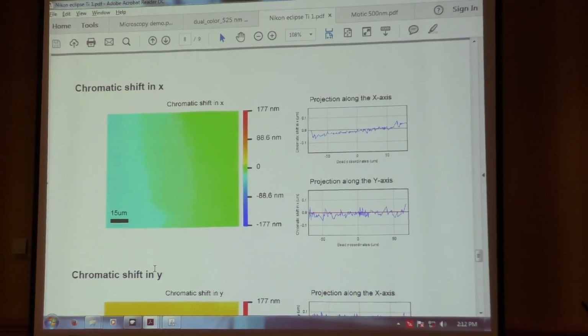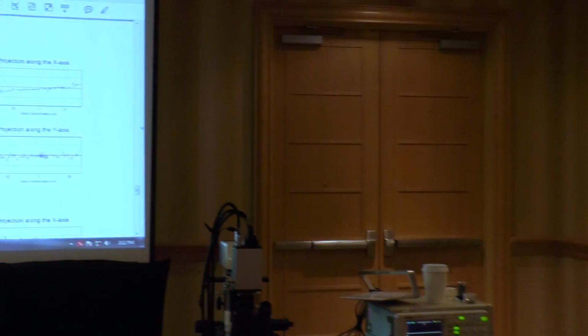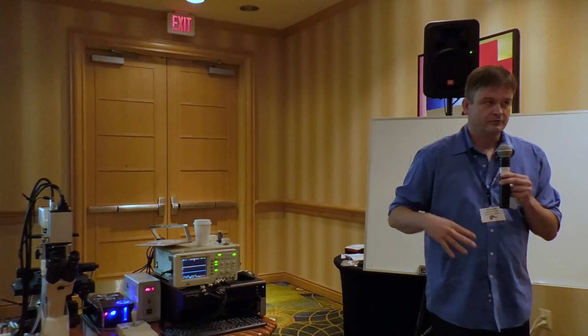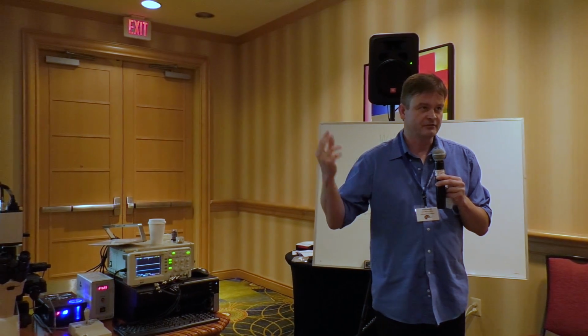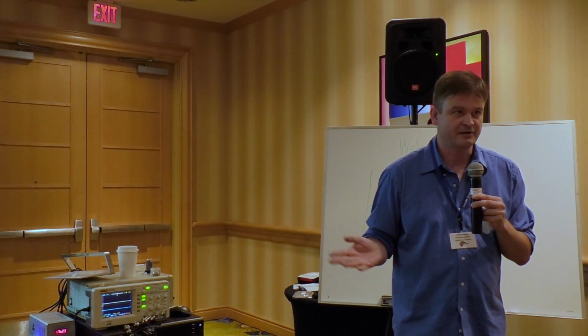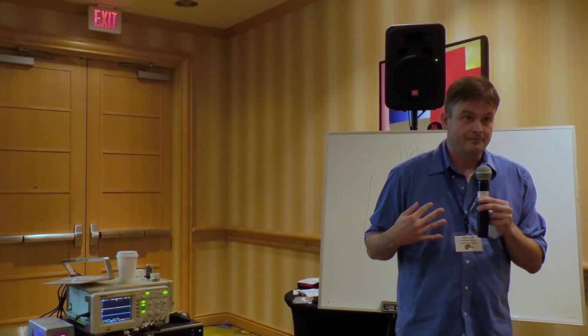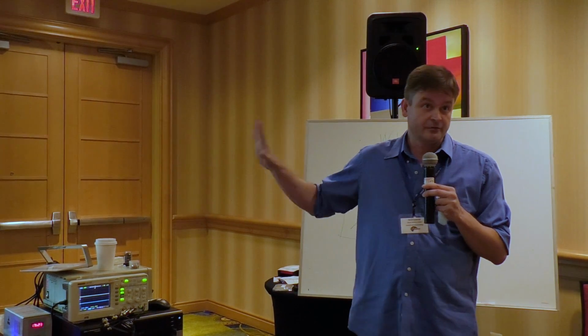What I see depends on where in the field of view I see it and what the condition of the sample is. Yeah? So some of the things that got me into a faculty position is to figure out how to get such data from the living cell so that I can do the registration on data that I acquire from my cell while I take the rest of the data. That might be overkill for many, many things, but this gives you an estimate.